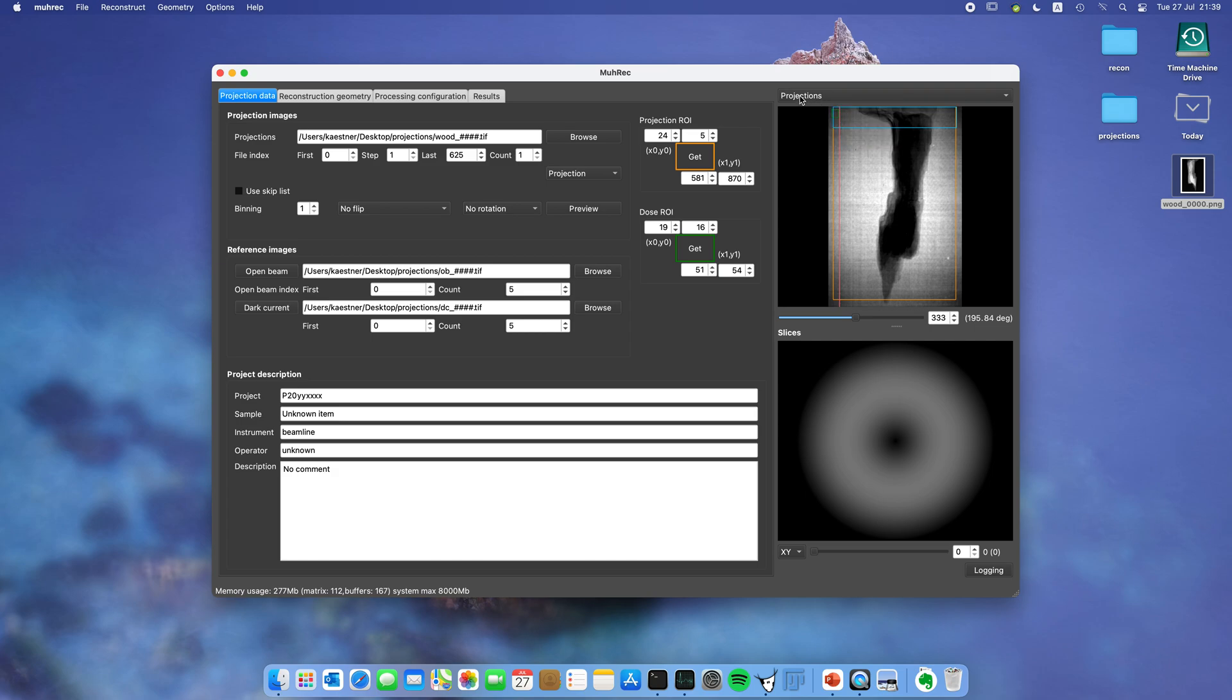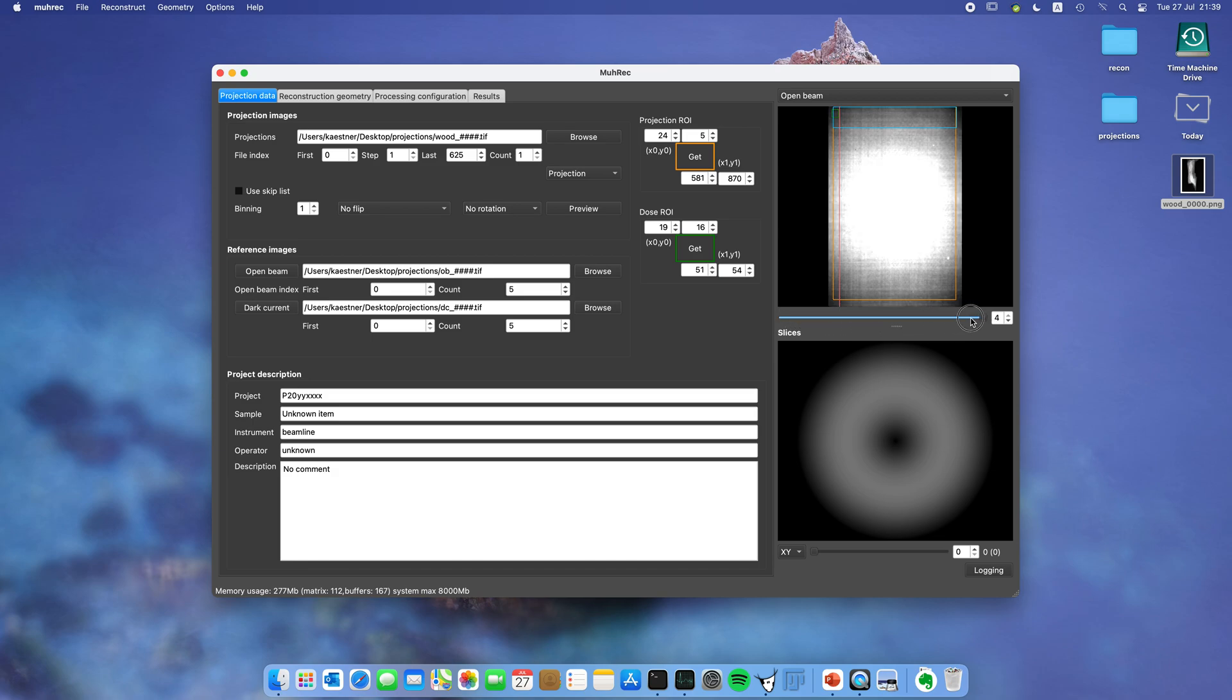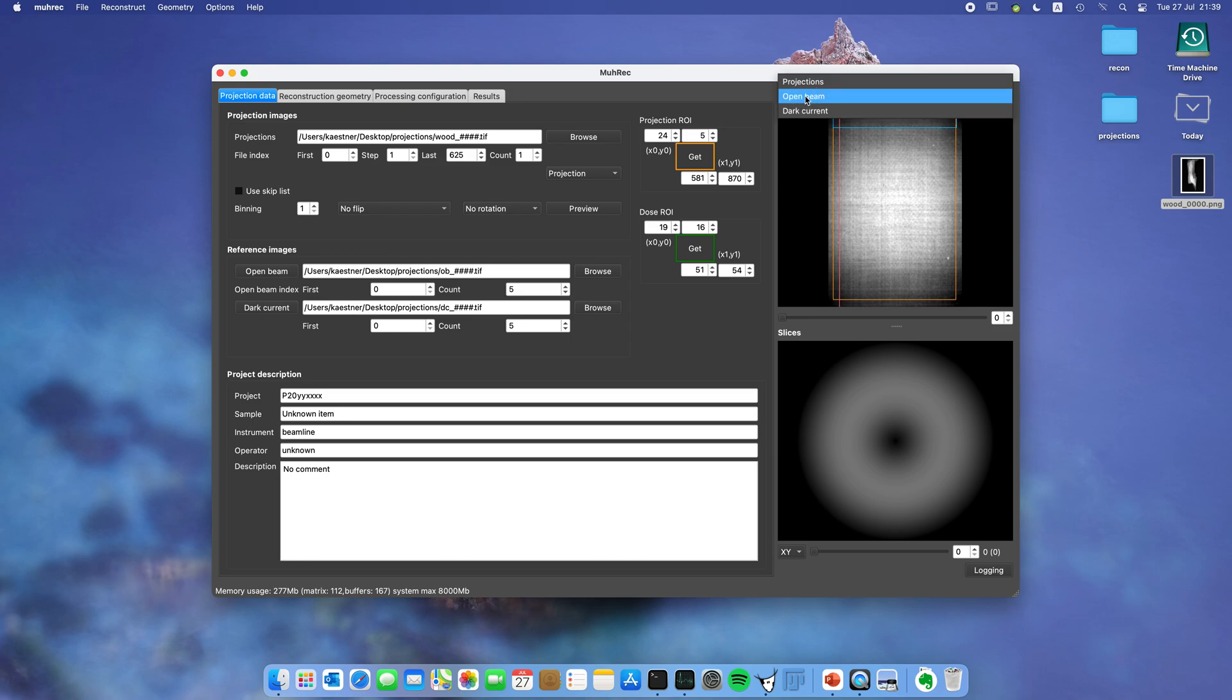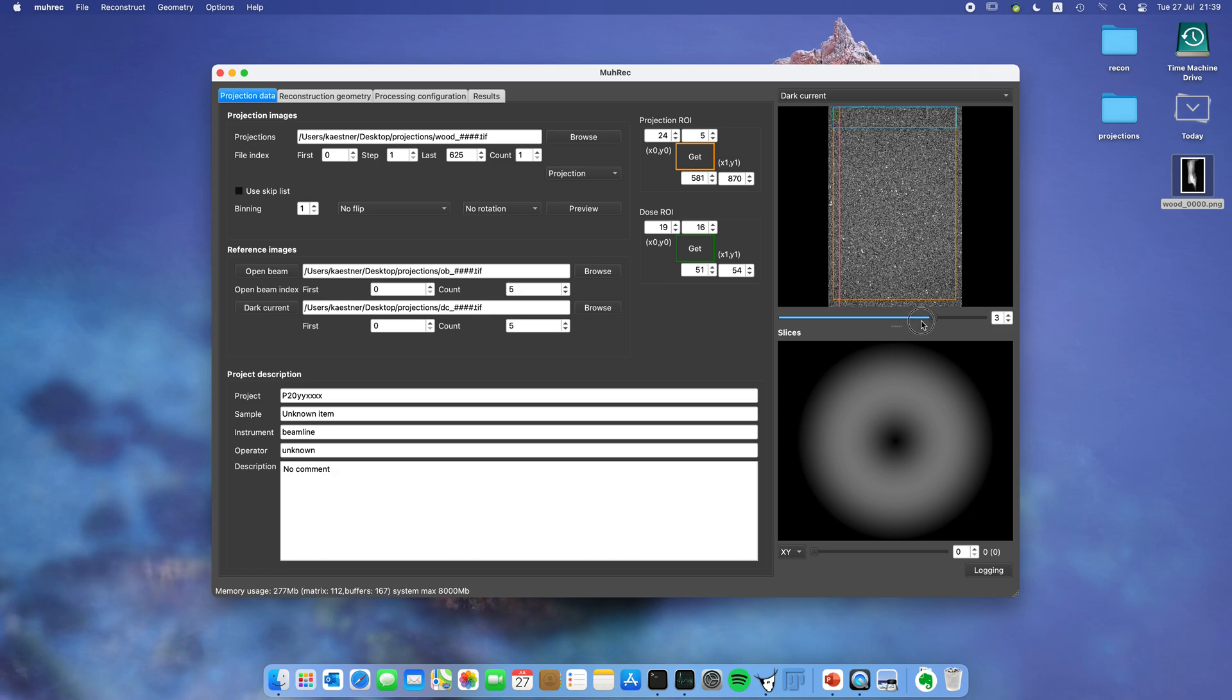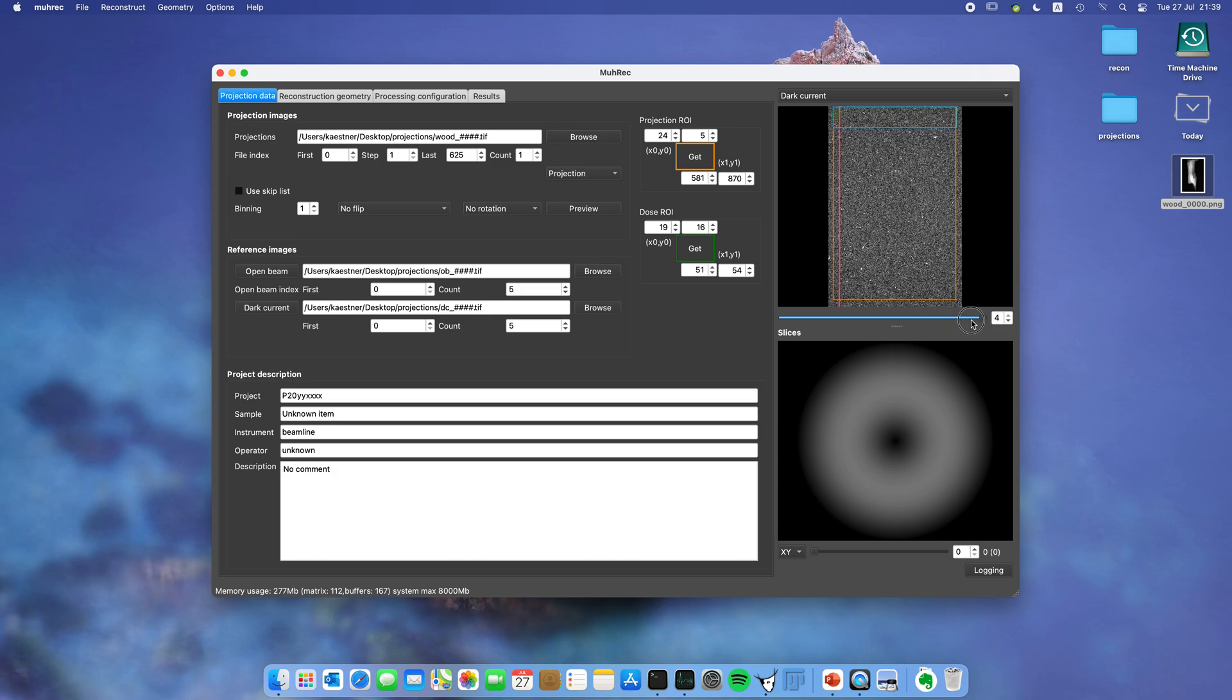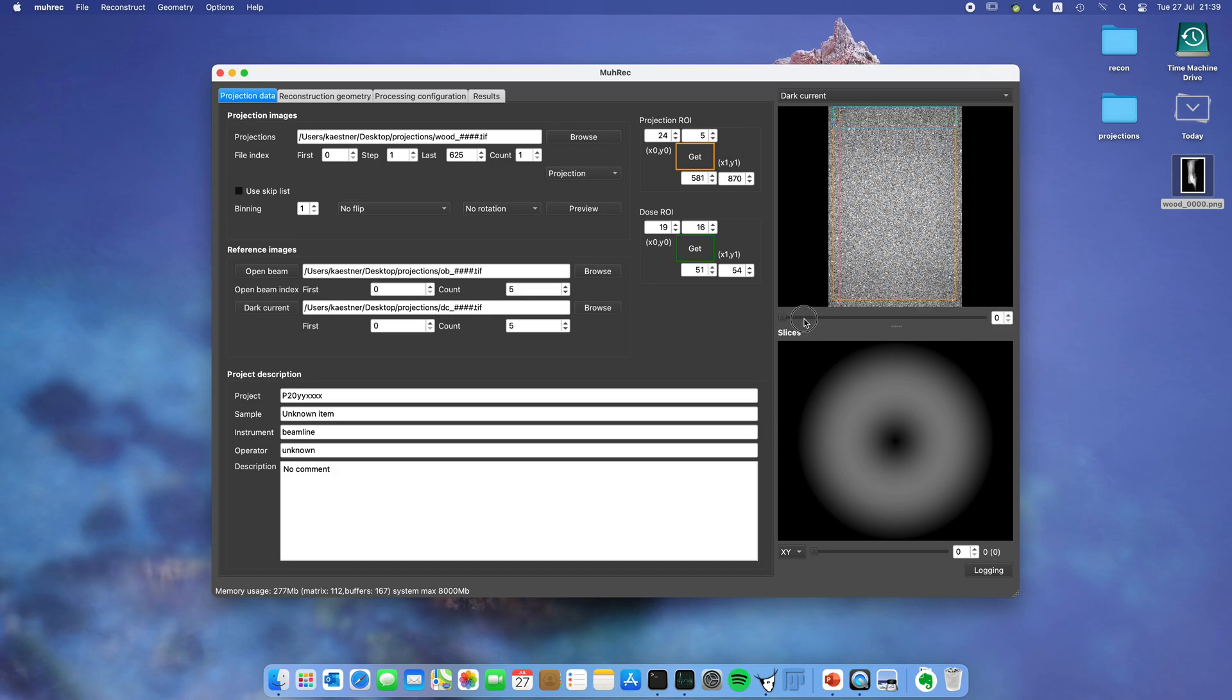Up here is the possibility to look at the open beam images. You can see them here, we have some different open beams. You can also look at the dark current. Usually it's not very exciting, but sometimes if there's a problem with your data it's good to have the possibility to check this.